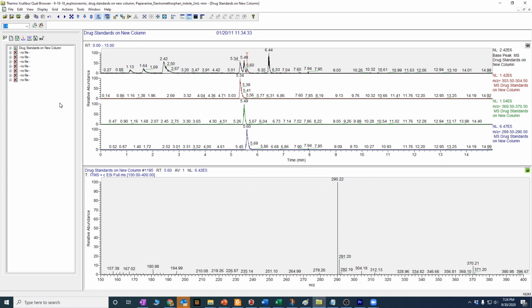And you can plot the chromatogram in different ways to enhance the signal to noise for specific compounds that you're looking at. So a mass spectrometer is going to be a really powerful detector. Most people, when they buy an LC, if you have the money, the mass spectrometer is more expensive than the LC. It's more like you buy a mass spectrometer and you purchase an LC on the side with it. An LC with a UV detector, it's almost always going to be the photodiode array.